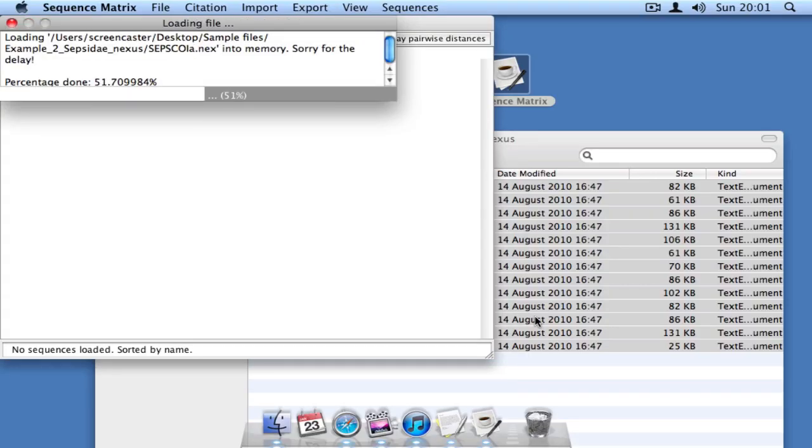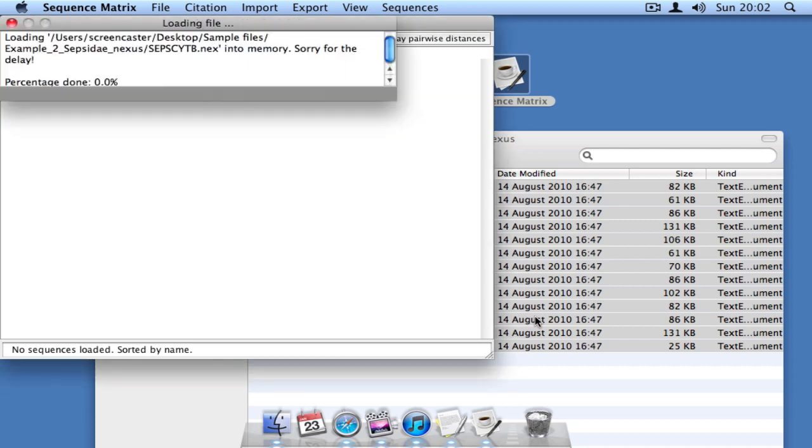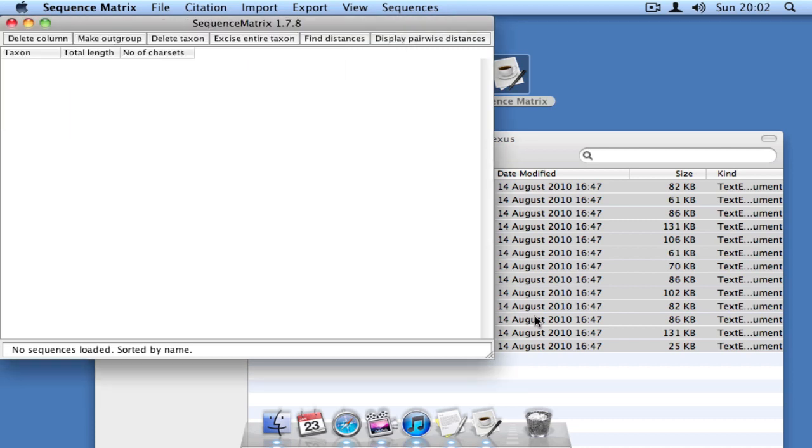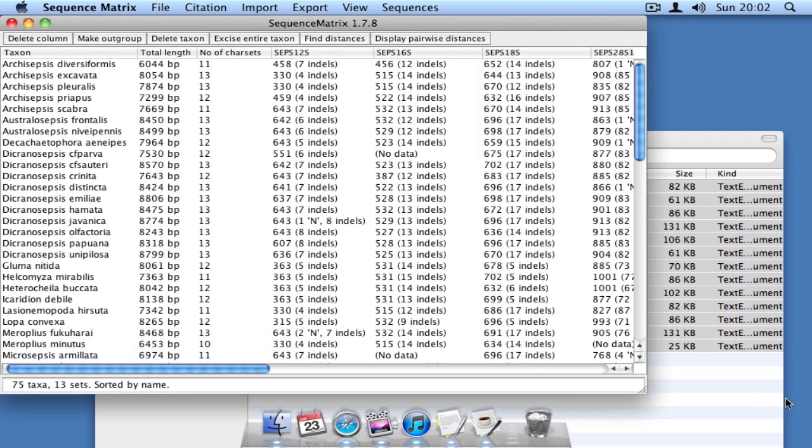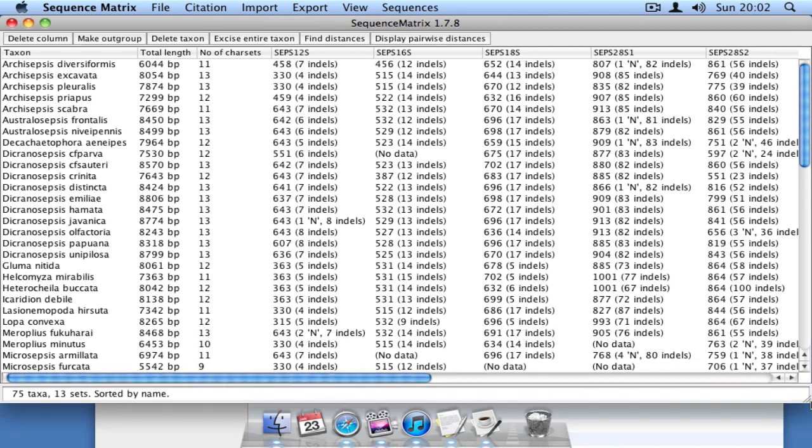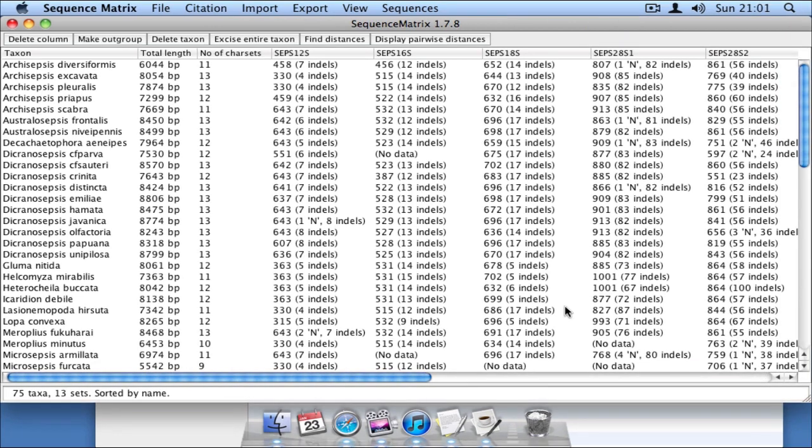If you select Yes, it will ask you this same question for each Nexus file. Note that it only changes the dashes at the beginning and end of each sequence, not the dashes in the middle, which represent true gaps.